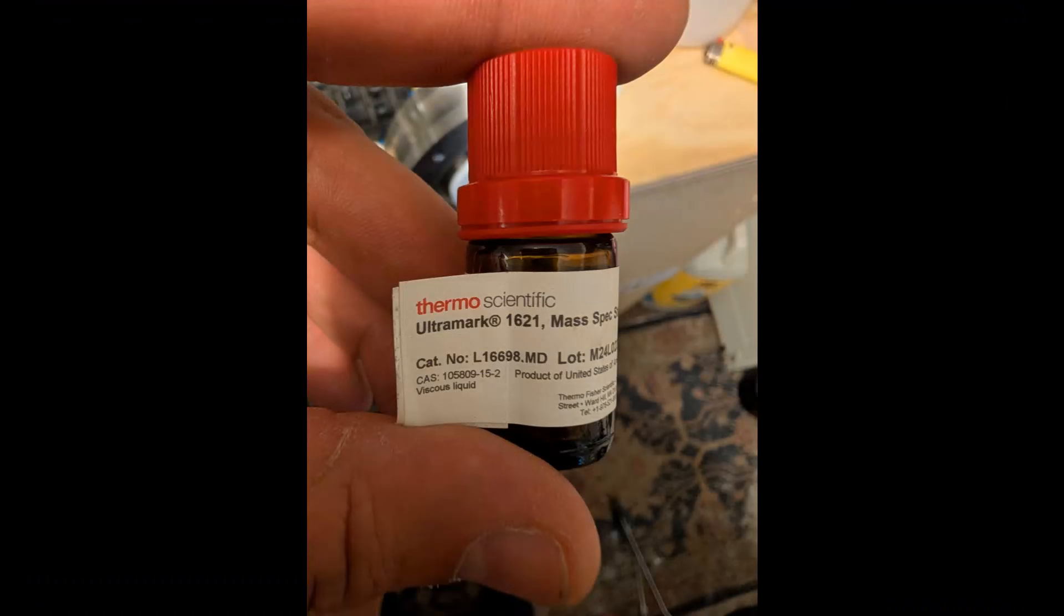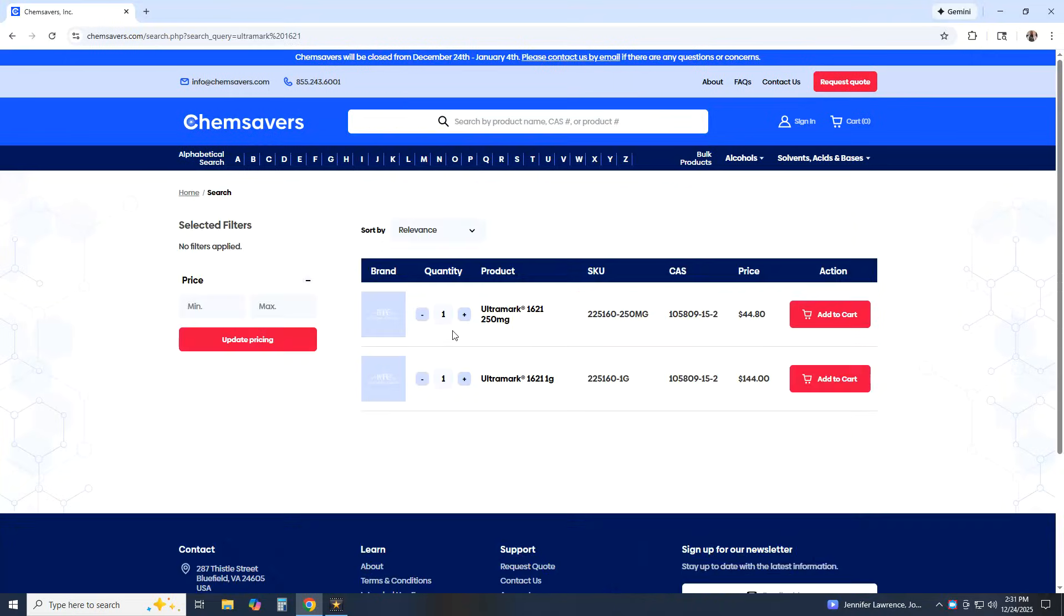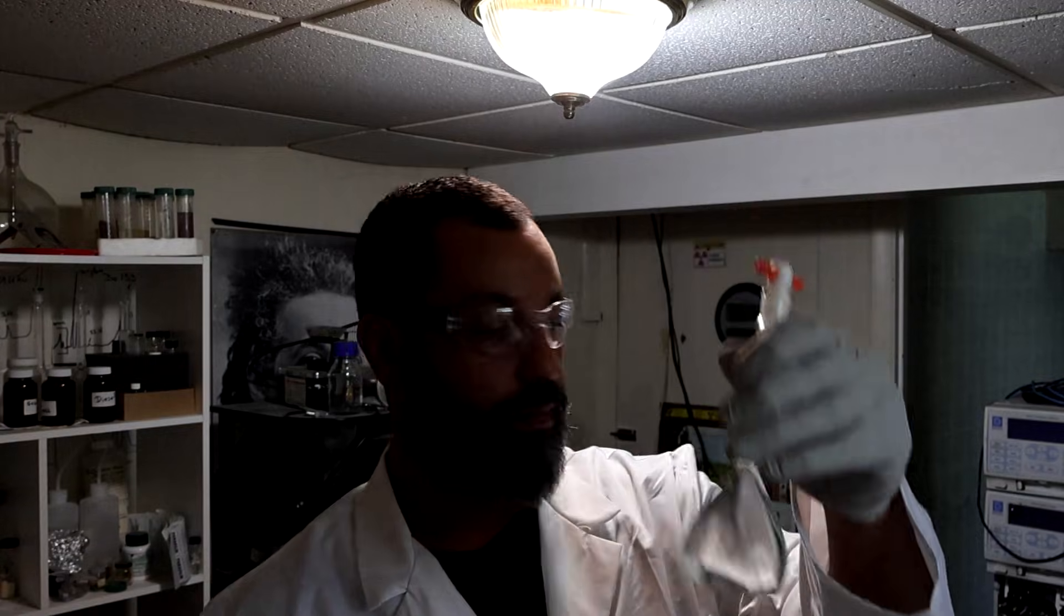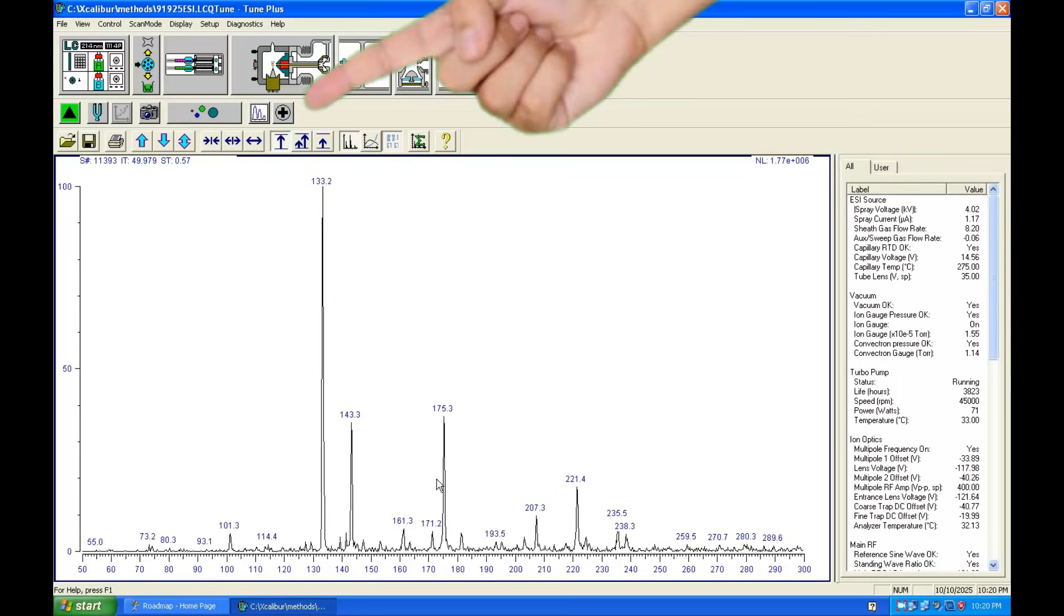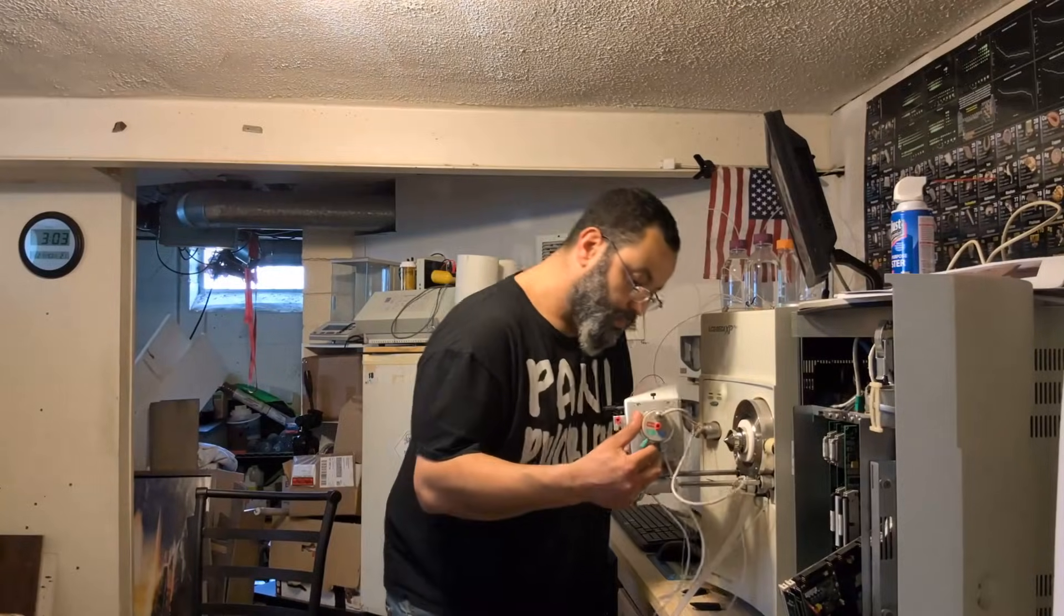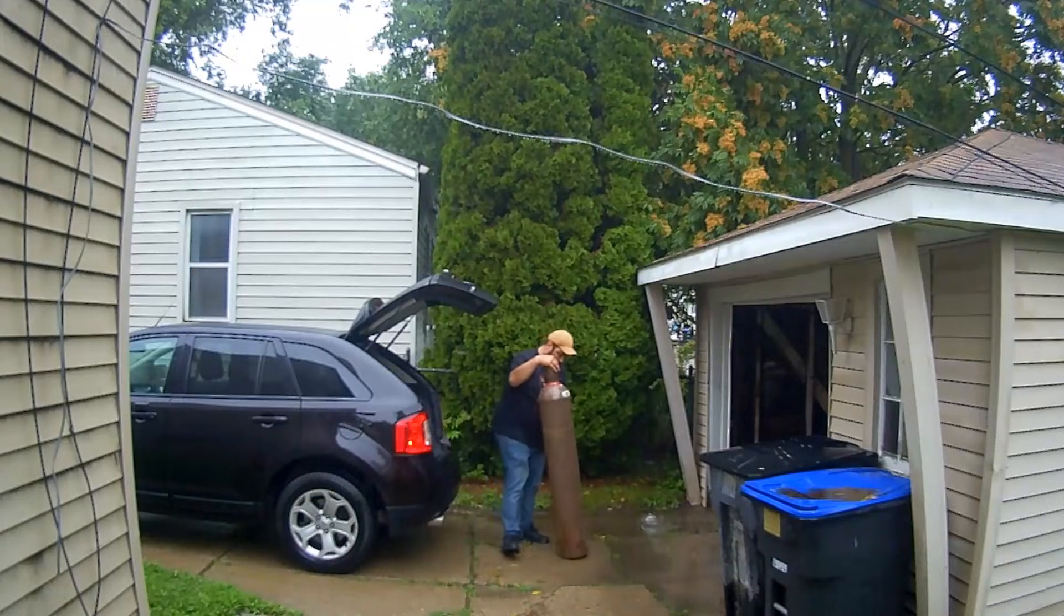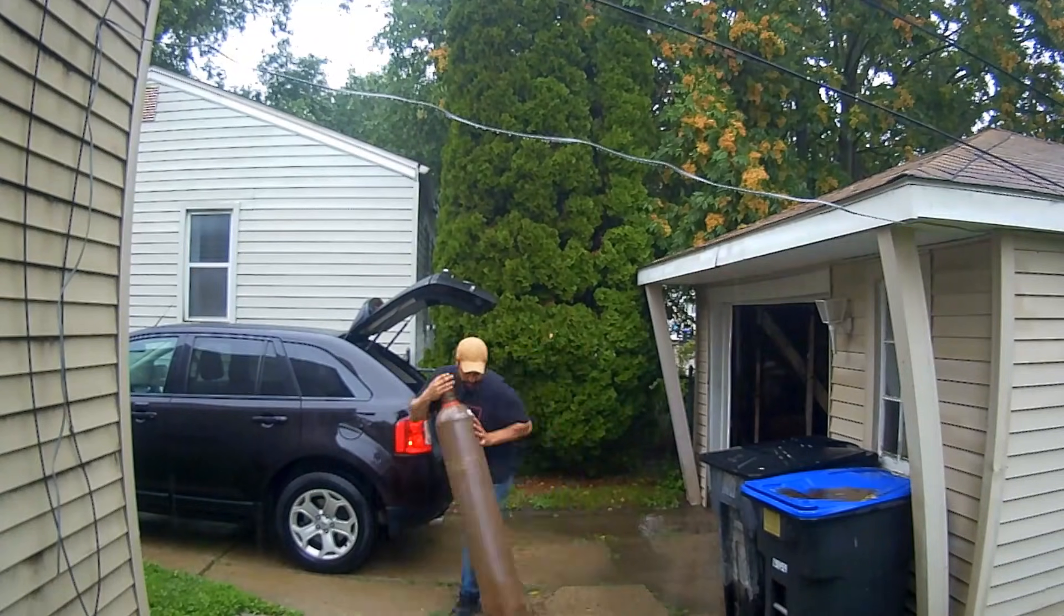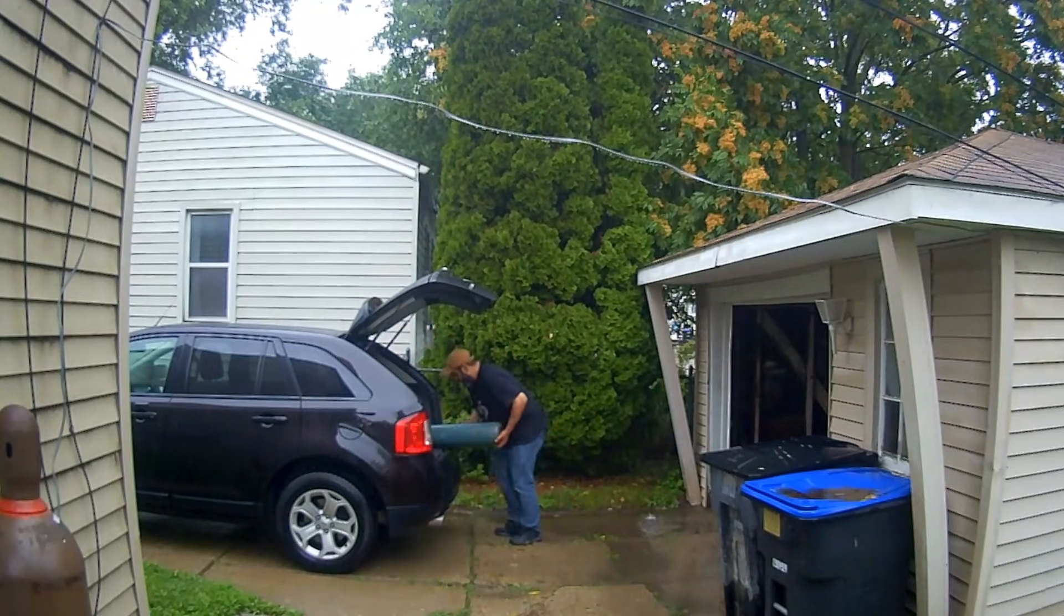The 250 mg calibration solution is of course off-limits for residential delivery, so I had to get creative to bypass this corporate liability issue. For a time I used a weak solution of cesium iodide in formic acid here. In positive ionization, cesium shows up nicely at its expected mass and so does iodine in negative polarity mode. Personally, I would prefer to use APCI but this consumes a lot of nitrogen. Sure it's cheaper than helium but I already made several trips for a refill and this is getting very annoying.